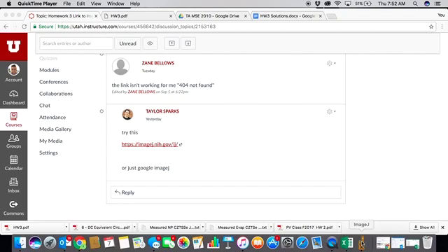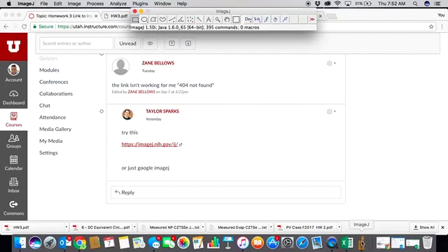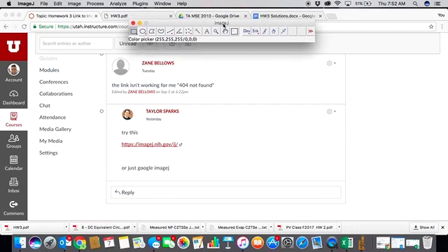And then once you finally get it downloaded and you open it up, you get this little ImageJ bar.